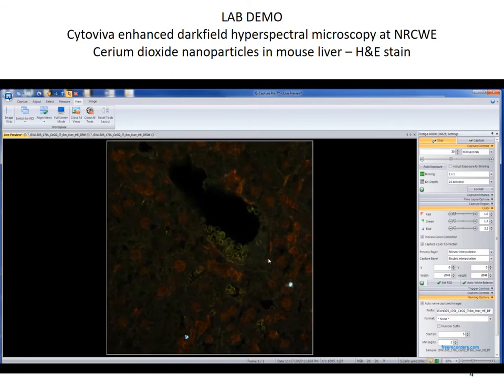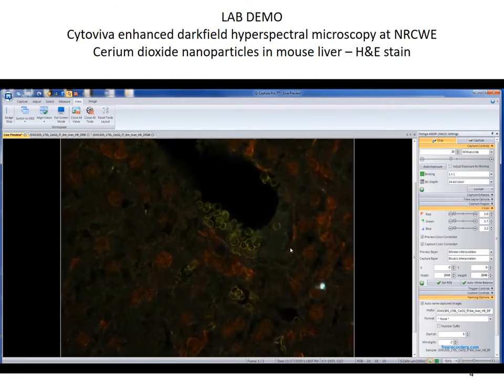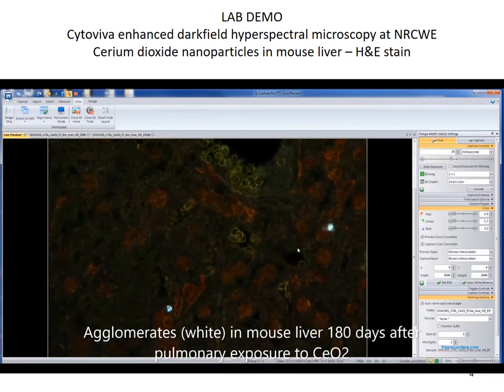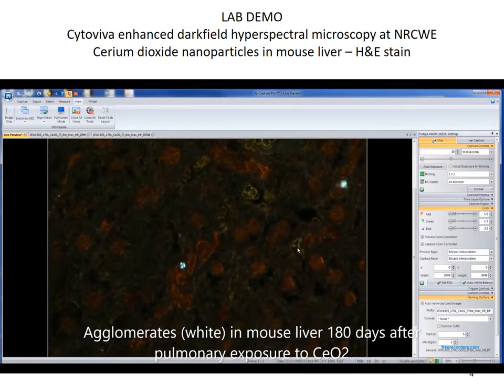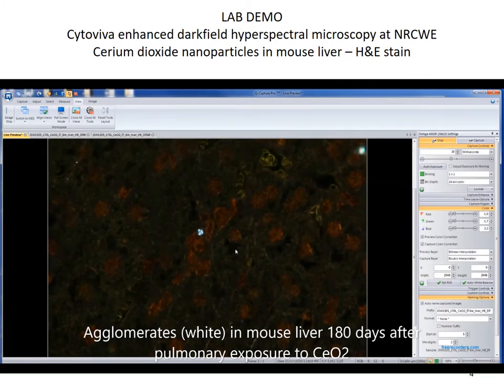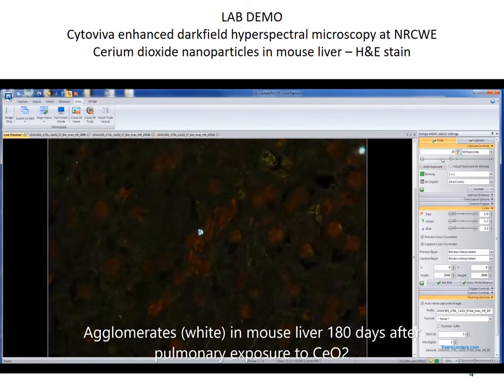You can adjust the focus for one of these scattering agglomerates, and you also need to adjust the exposure time. Usually, if it's metal oxides like here, the scattering intensity of the particles is so high that you need to lower the exposure quite a lot to be able to see the actual particle agglomerate.